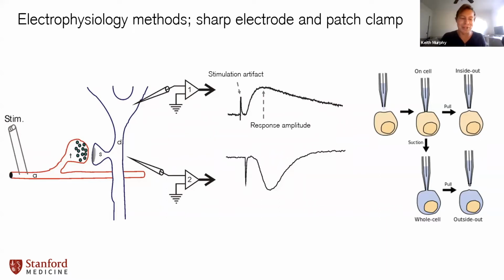Mm-hmm. And ultimately, though, you're getting at that the cell is moving around quite a bit. And this seal between the cell and what they often call a glass pipette, but we'll just call it a patch clamp, this seal is extremely sensitive. So even when you're working with healthy cells and not delivering ultrasound, sometimes it'll just break loose. So you can imagine radiation force moving the cell easily disrupts this and ruins your recording, as Kim was describing. I don't have that video, but we've probably shown it a bunch of times by now. Maybe the students remember.